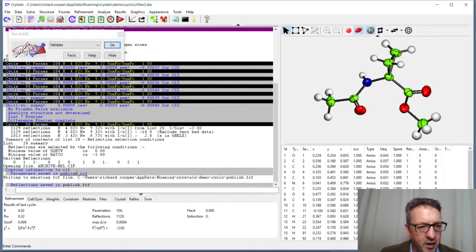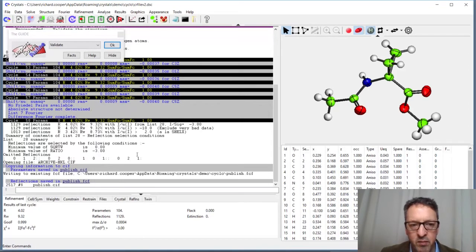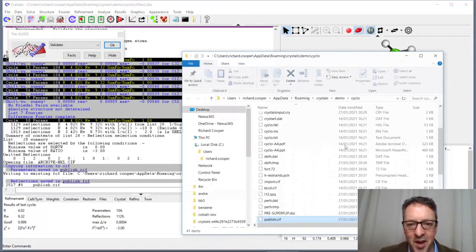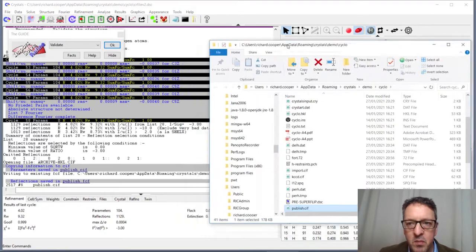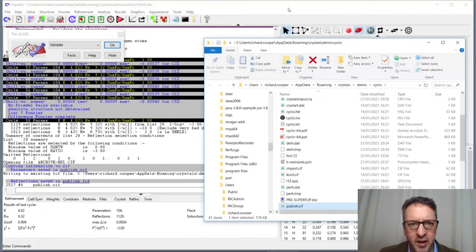And we can get to that really quickly by just clicking on the underlined text there, like a hyperlink, and that will just open up a copy of Explorer for us any second now. There it is, with that file highlighted. So we'll come back to that window in a second.